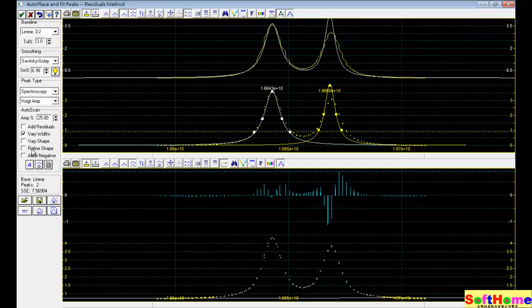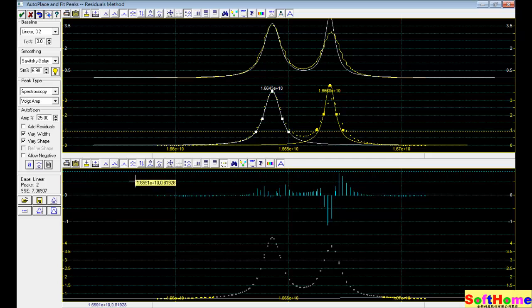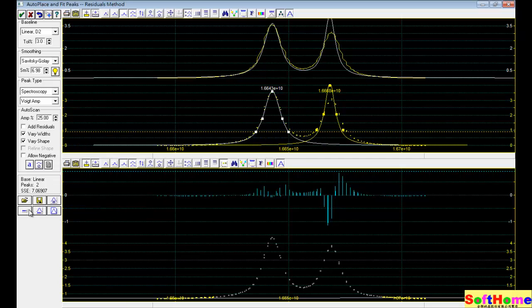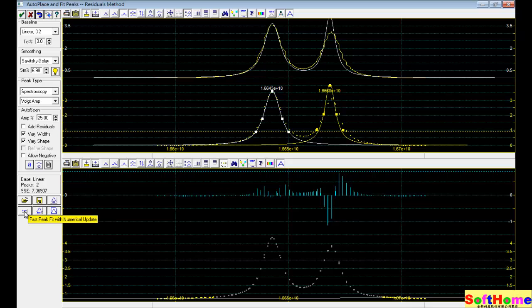Now there are only two peaks. We change the parameter, the various weights. And we use the automatic method, this one. Now fit the original data.